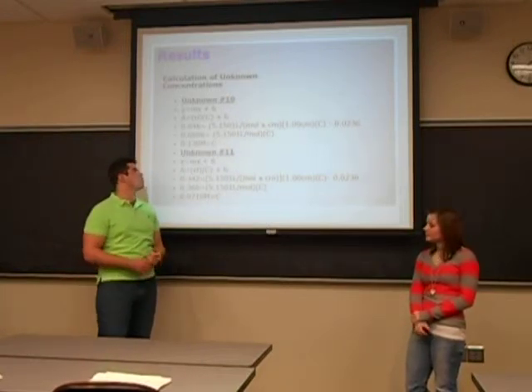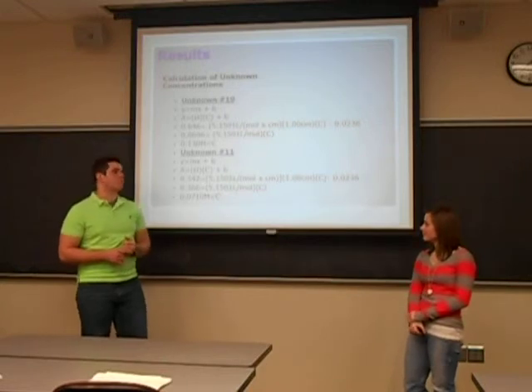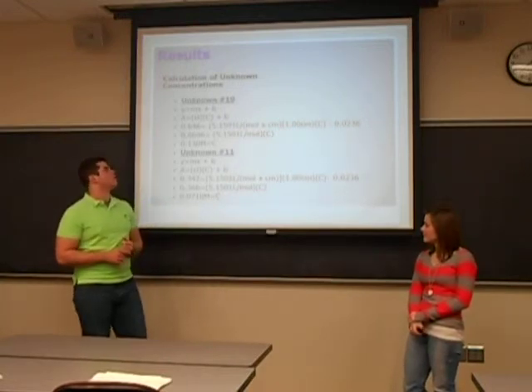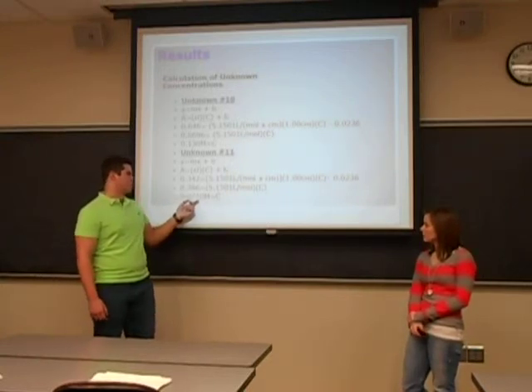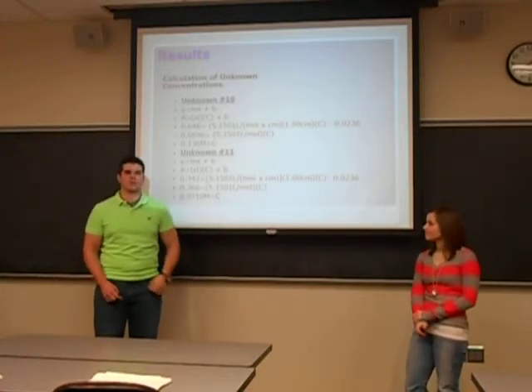We ended up getting 0.130 molar for unknown number 10. And then we ended up getting 0.0710 molar for the concentration for unknown number 11.